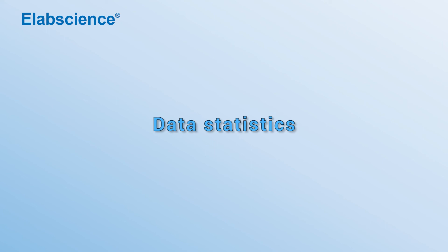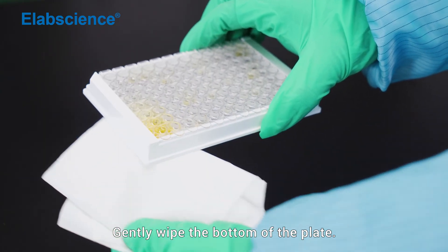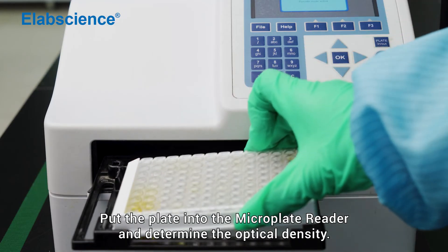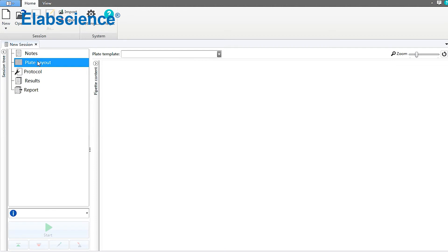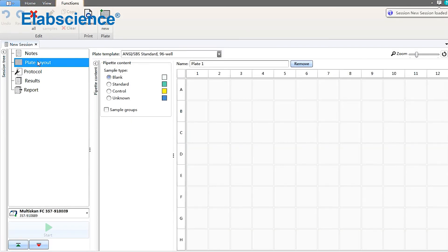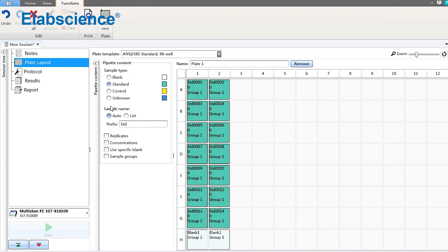Data statistics. Gently wipe the bottom of the plate. Put the plate into the microplate reader and determine the optical density.